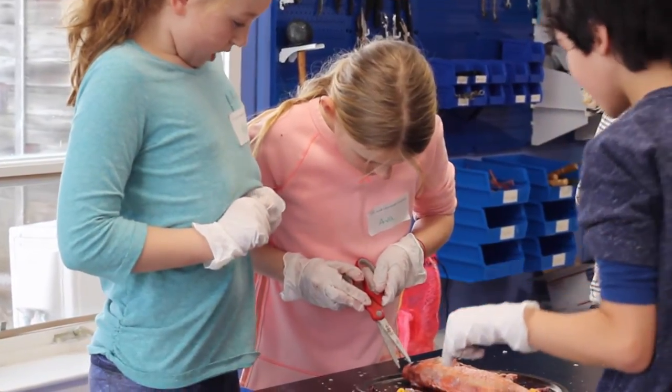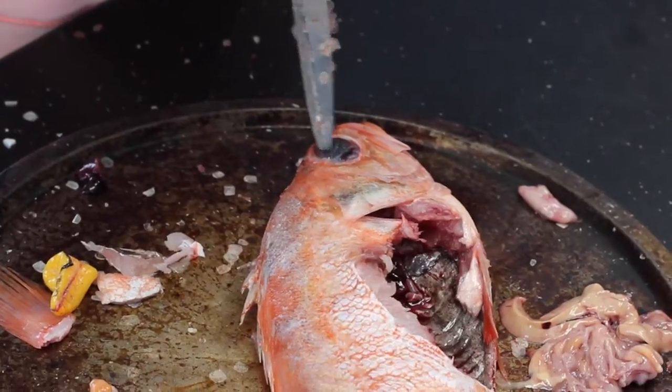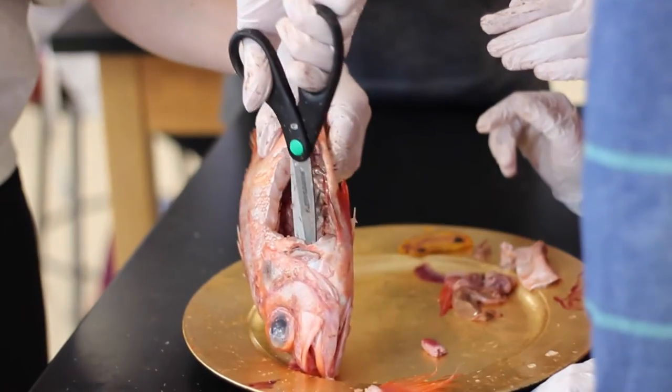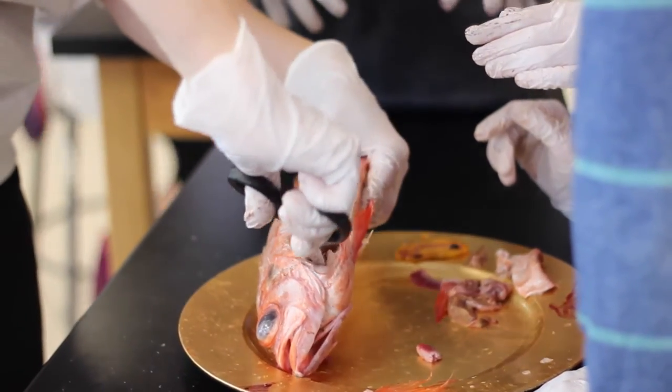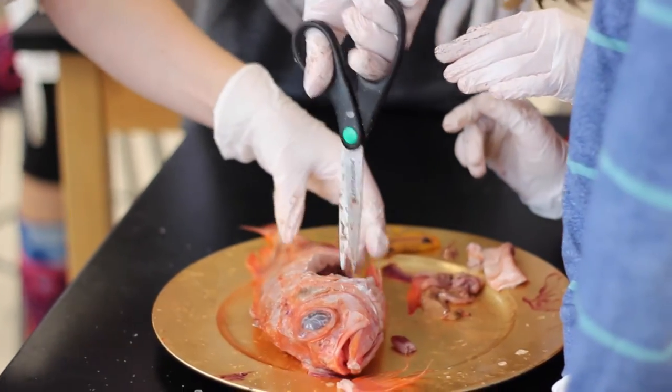You're going to look for a little ball, like a little marble inside the eyeball. You have to dig it out. We just have to do this right here.